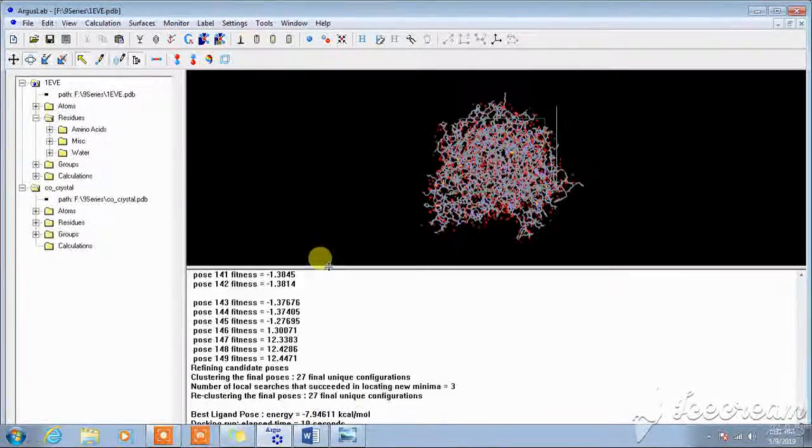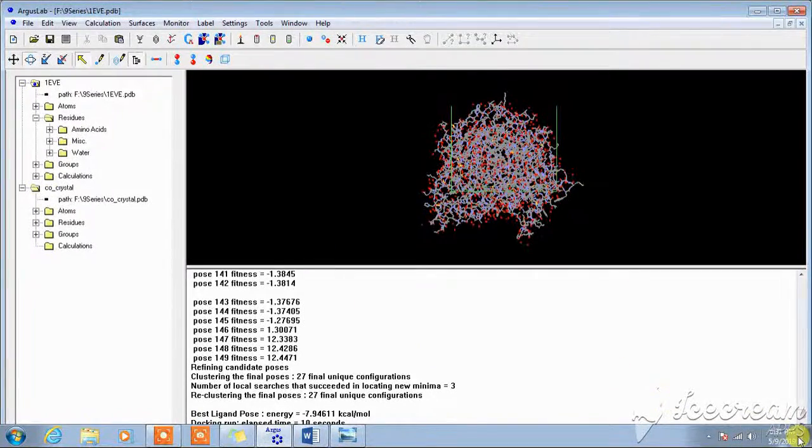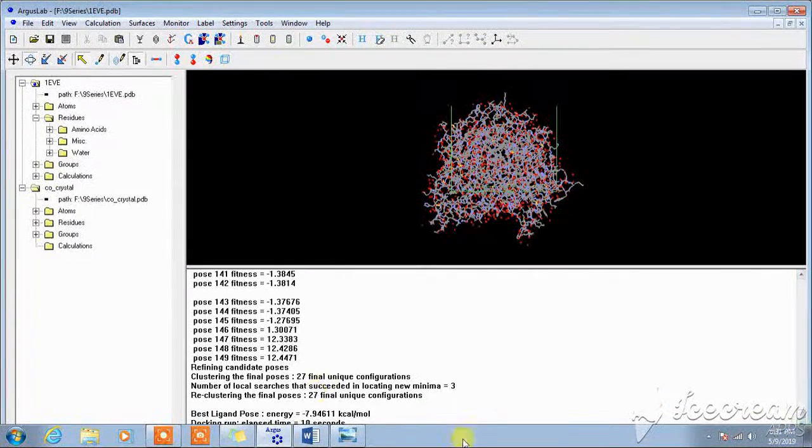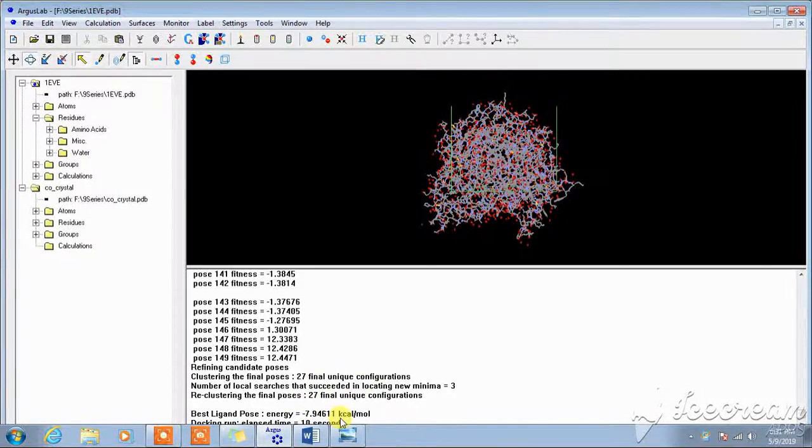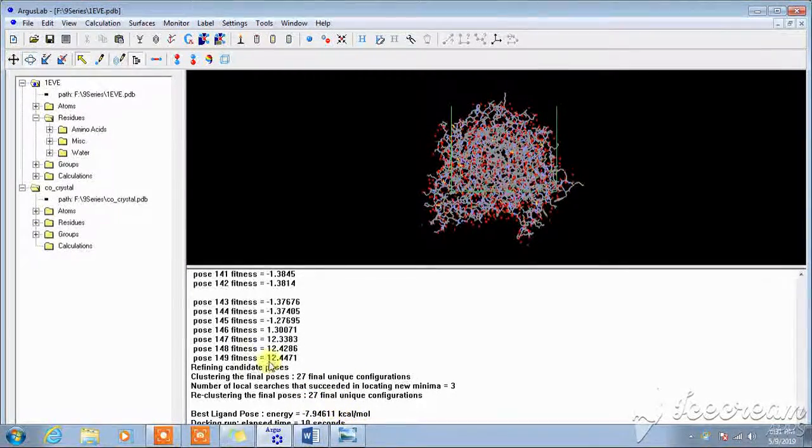This is for the writing part. This is the best ligand pose docking energy, or we can write it as the binding energy.